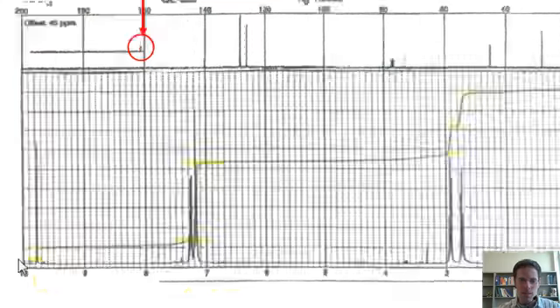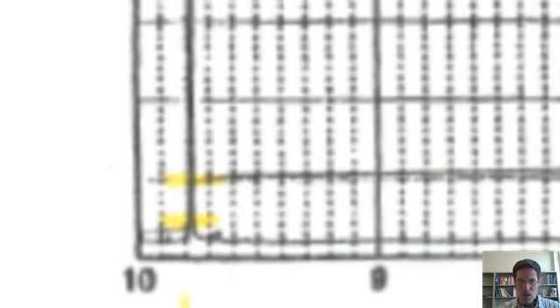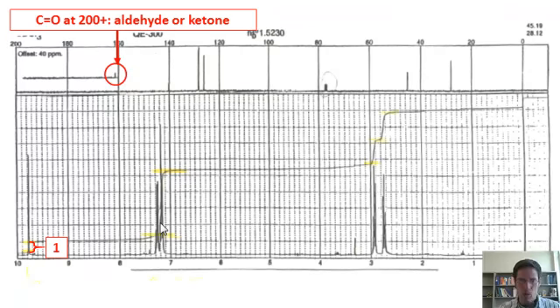The next thing that I do is I look at my hydrogen NMR and I do the integration. If I measure the height of this integral curve beginning at the horizontal line to horizontal line, so I start measuring it from where it goes horizontal to vertical and where it stops going vertical to horizontal. This height right here is the smallest of all of these integrals. I'm going to call it 1.